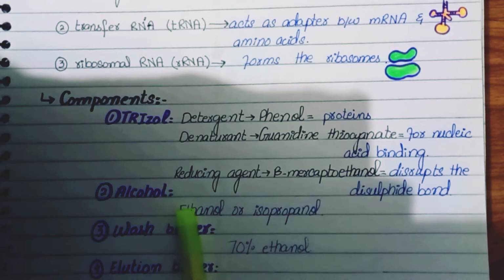Next we have alcohol. We can use ethanol or isopropanol. Next we have wash buffers, that is 70% ethanol, and the elution buffer is RNase free buffer or nuclease free water. So here are the components that we require for RNA extraction.